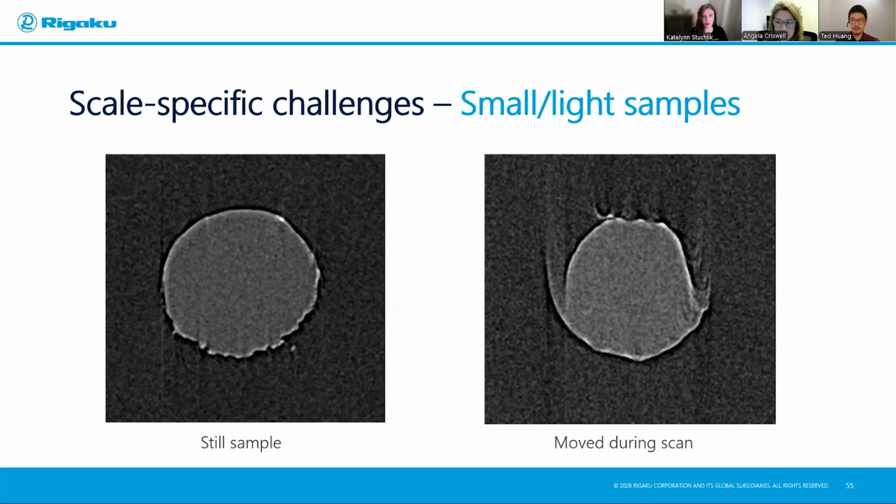Technically, you can say this is not just limited to smaller samples, but these movements are very tiny a lot of times, and you'll only vividly notice it when you are also pushing for that resolution limit. Maybe they only move for a couple microns or tens of microns. When you're scanning at a larger field of view with low resolution, those micrometers of twisting or shaking don't matter. But when you're scanning at very high resolution, they do. So sample mounting and sample stability becomes very important.